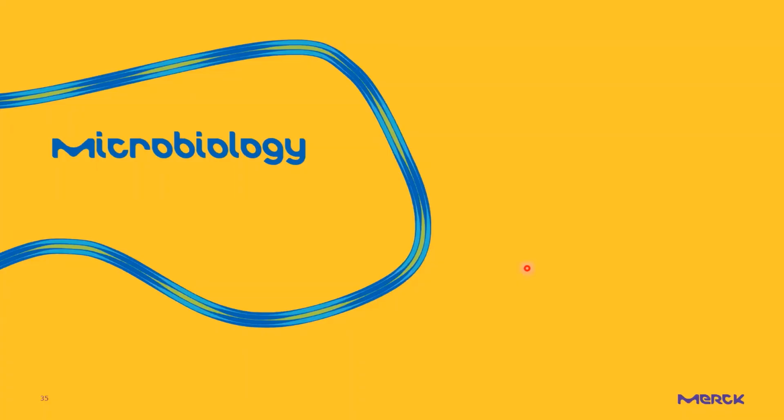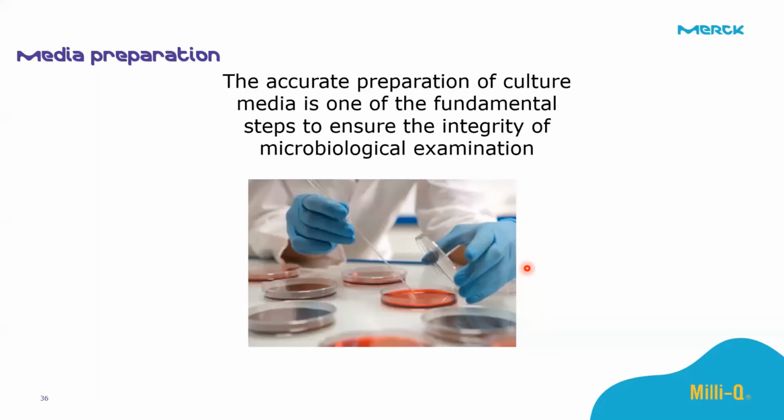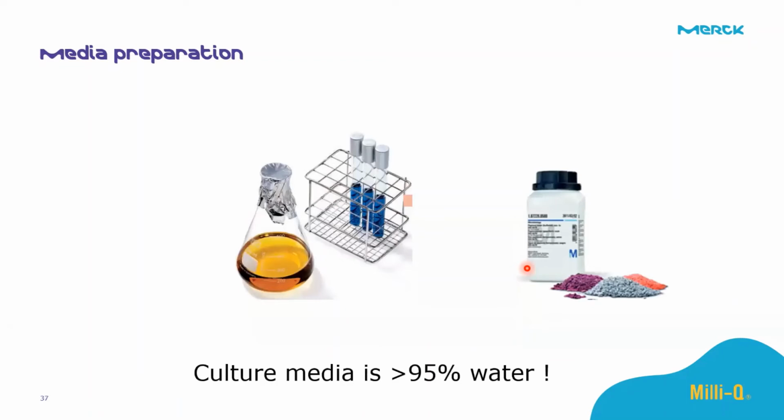When it comes to microbiology, also a very important analysis done in the lab, it is very important to note that preparation of the media is one of the fundamental steps to ensure integrity of microbiological examination. And water plays a key role because over 95% of culture media is water.